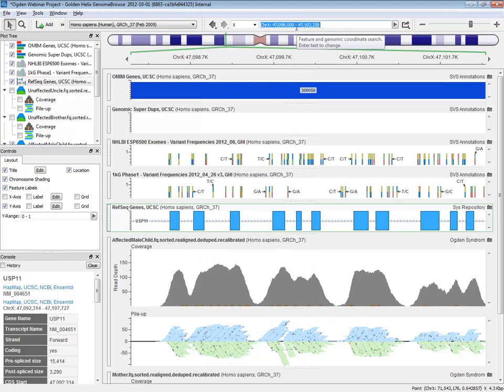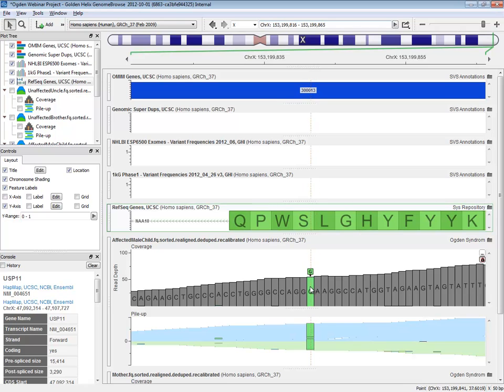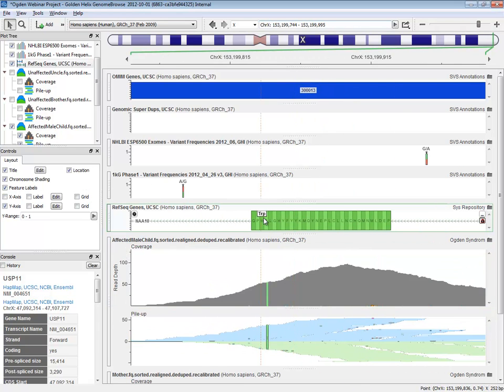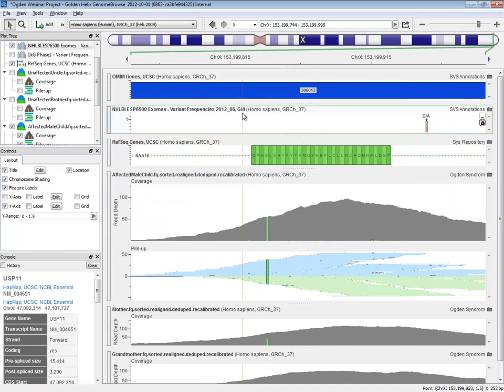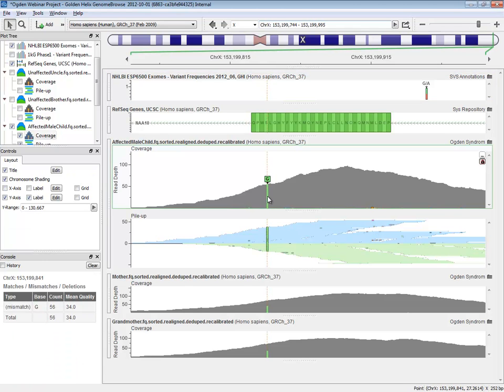Let's go ahead and jump to that location for our variant we're validating, and sure enough, here it is. You can see where it is in the amino acid sequence, and you can see where it is in the gene. For this exon, I'm going to center this exon of NAA10, there are no other variants in either of these catalogs. I'm going to go ahead and just hide these so we have fewer things we're looking at, and there's also no segmental duplications. It's also an OMIM gene, meaning this gene has been associated with other Mendelian diseases in a diseased state. And so the information here is very, very clear.